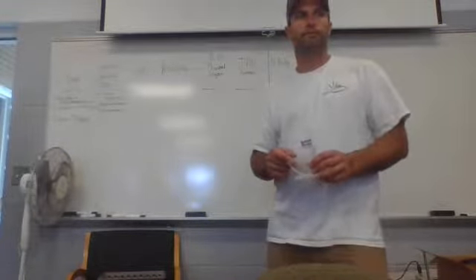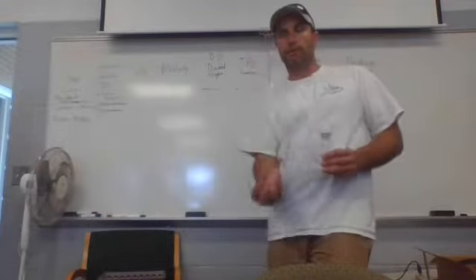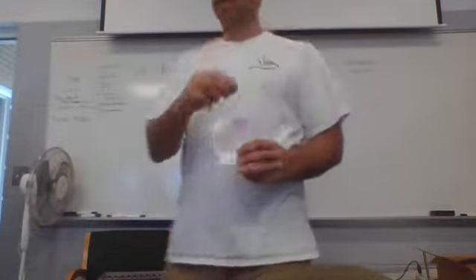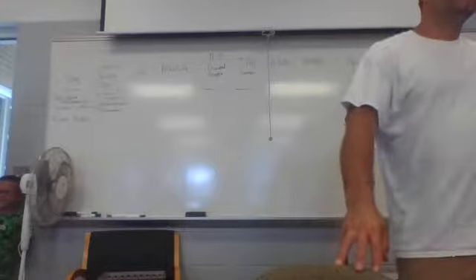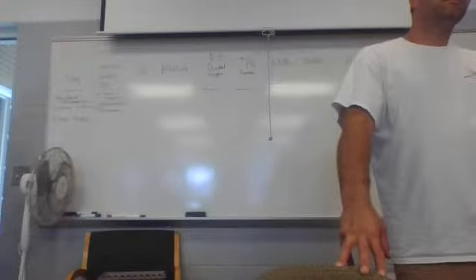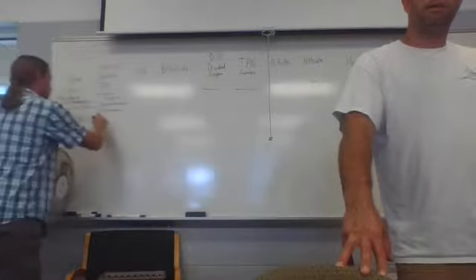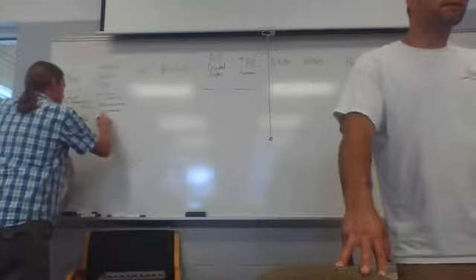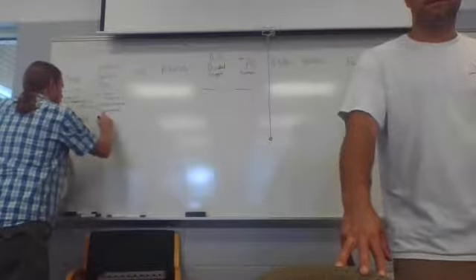Oh, the glass hydrometers. Okay, so that has a weighted bottom, has a certain density. It'll float up and down, and there's a scale on the thing. How else could we measure conductivity? Probe. All right, so you're measuring the ability of it to conduct electricity.